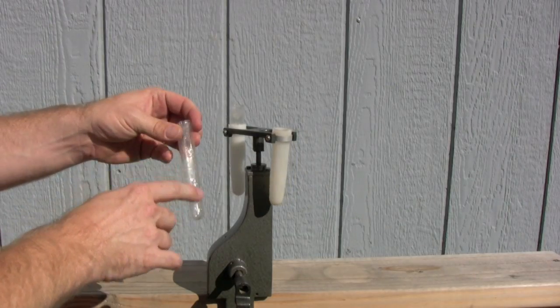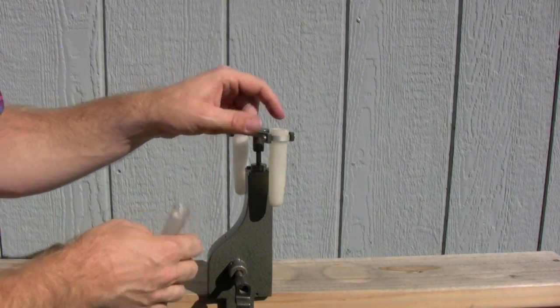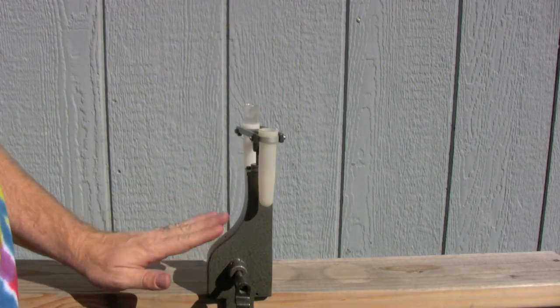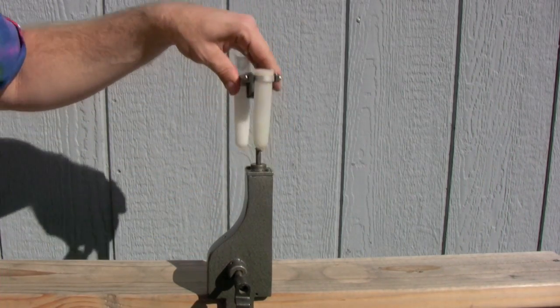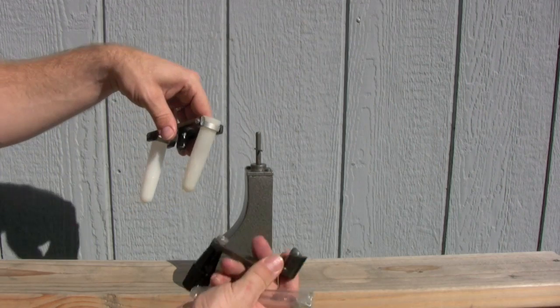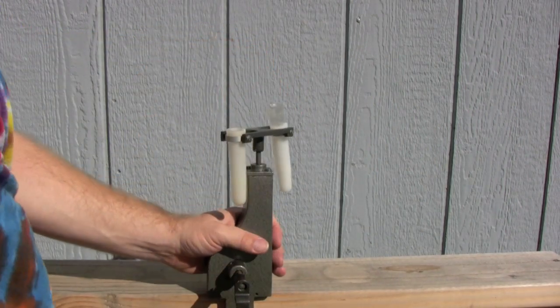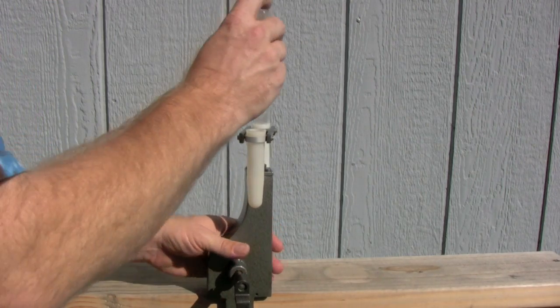It comes stock with two glass centrifuge tubes that are protected. This is the centrifuge tube holder. It easily attaches to a bench and it's extremely portable. The top comes off, the handle comes off — you can take it anywhere you'd like. It attaches to the bench with just a standard attachment down on the bottom.